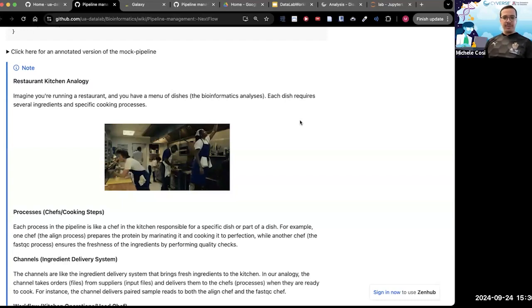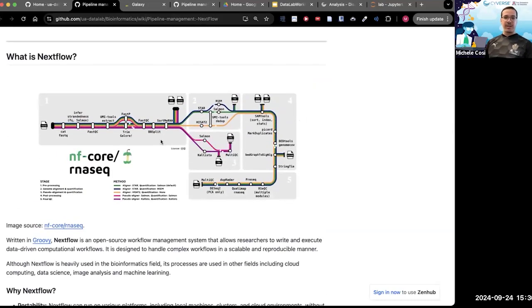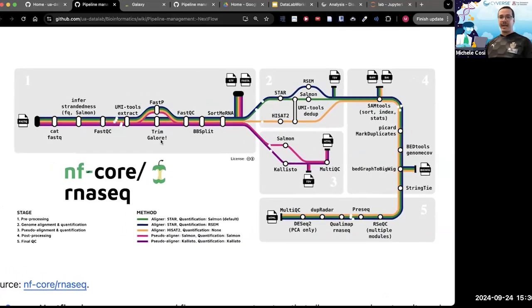But I'm gonna scroll up a second, because there has been this chart right here, which perhaps allows you to understand things. As you can see, the FASTQ data comes from here and is fed into aligners, into FASTQ processes.